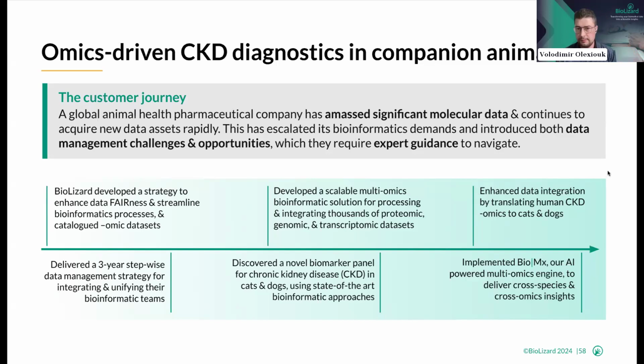So our first assignment was, of course, to integrate all those different data resources and ensure that we have a proper data management system in place, as this is the foundation for all the downstream analytical work. And then we started out with the bulk approaches, integrating them into a multi-omic framework to get insights.